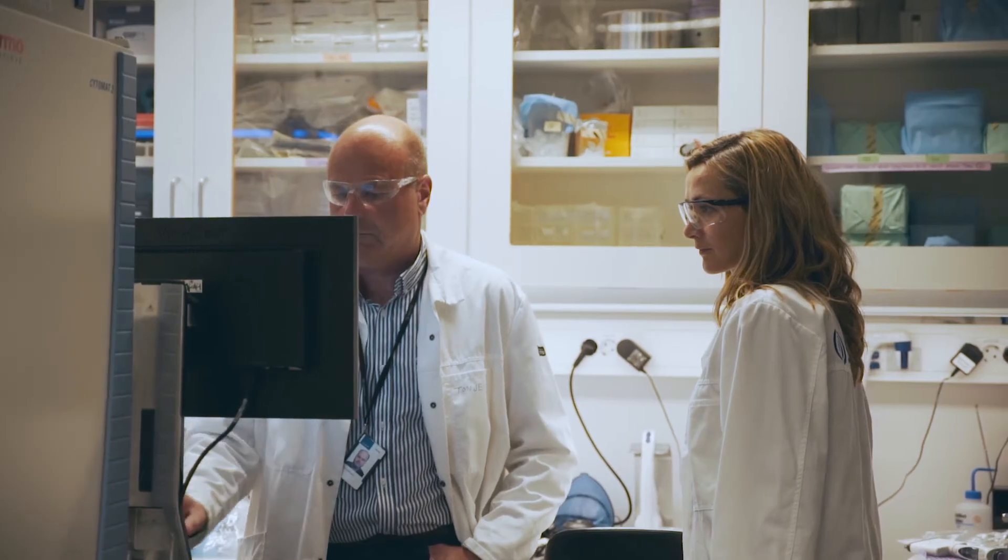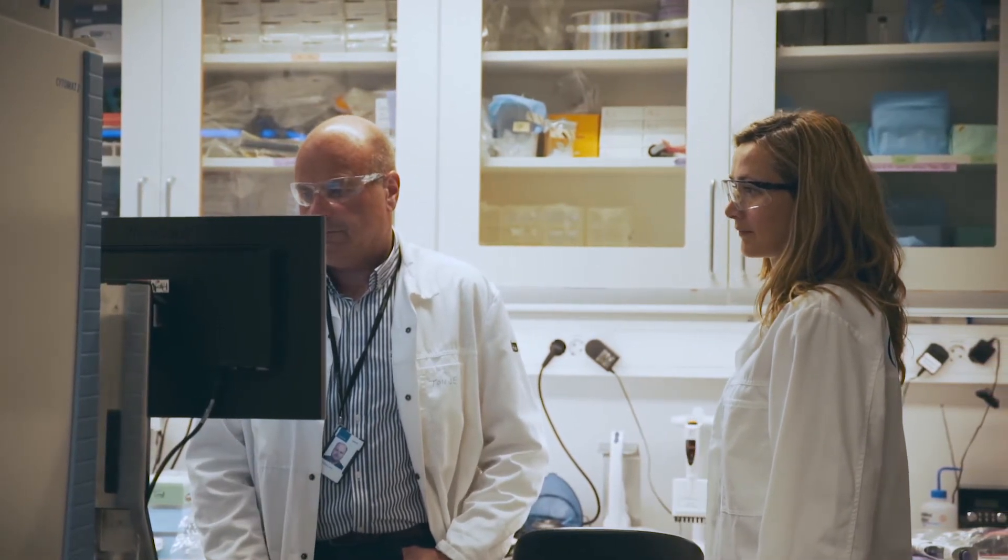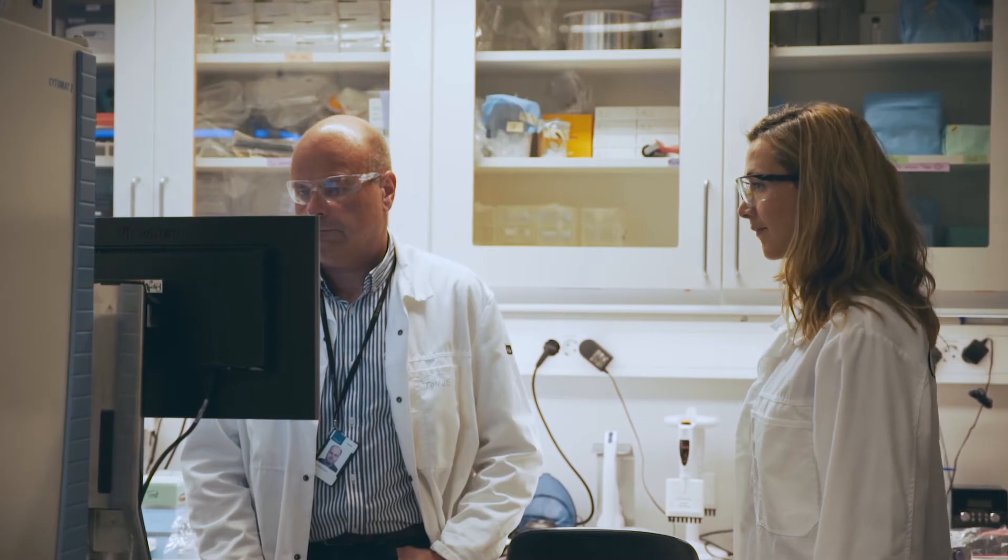Biomech software offers versatile pipetting control through its user-friendly interface, which can be easily maneuvered by experts and novices.